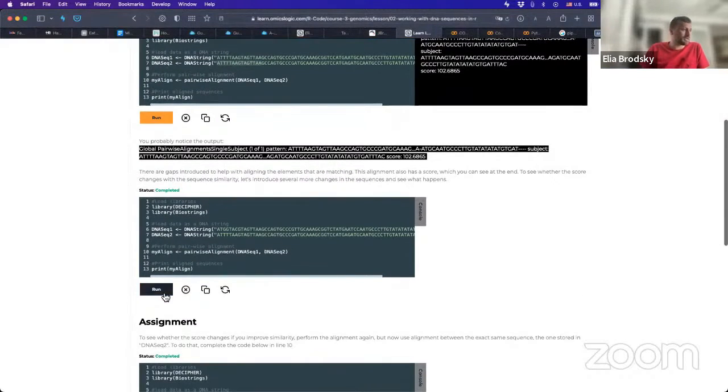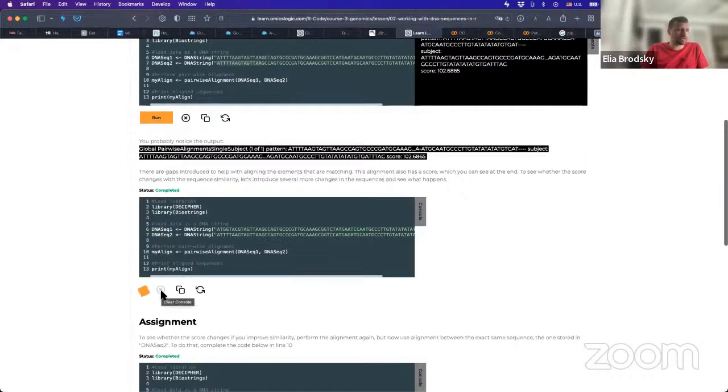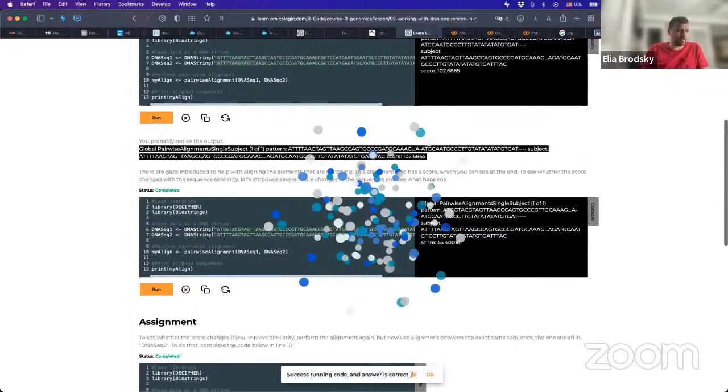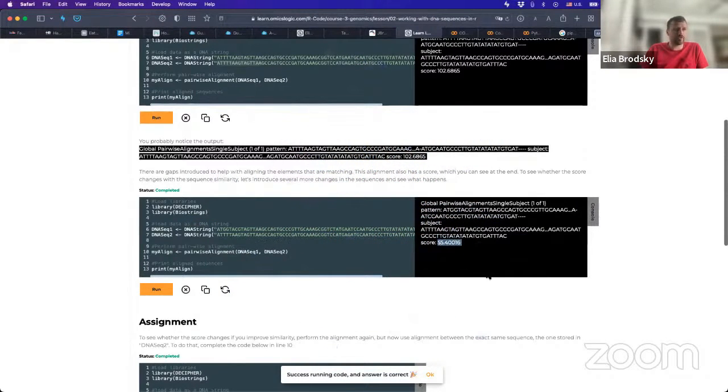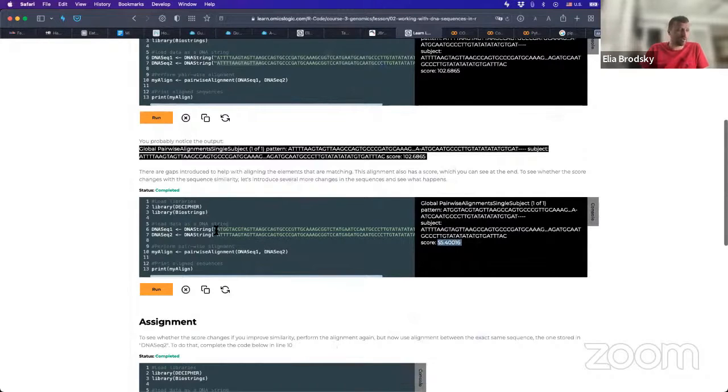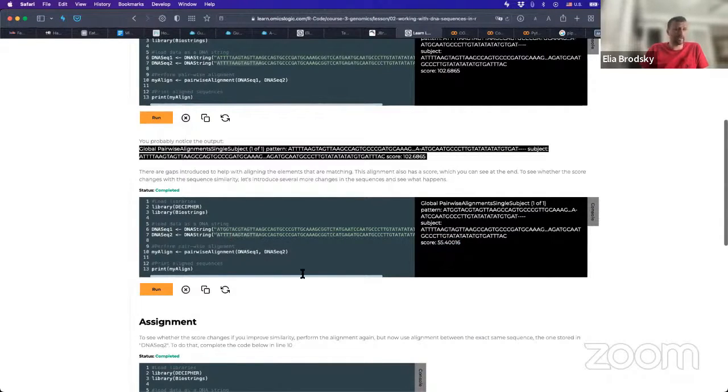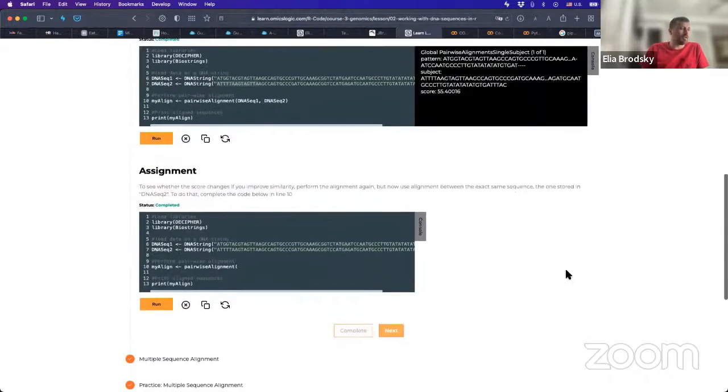In the second part, we can run it, and we can notice that the score is actually different. So here, the score is 55. So it went down. And we can notice that in the beginning, they are not the same.